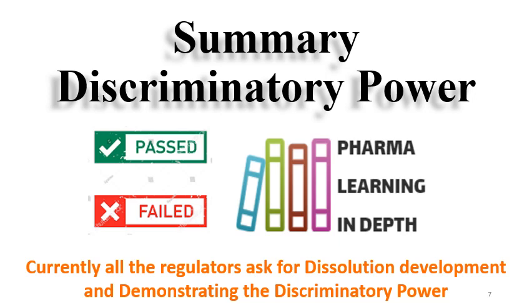See, nowadays all the regulators are asking for dissolution method development and for demonstrating the discriminatory power. Almost all of the generic applicants get the query on dissolution for tightening the dissolution specifications and for showing the discriminatory power.